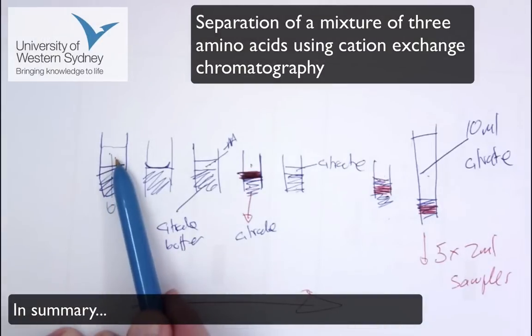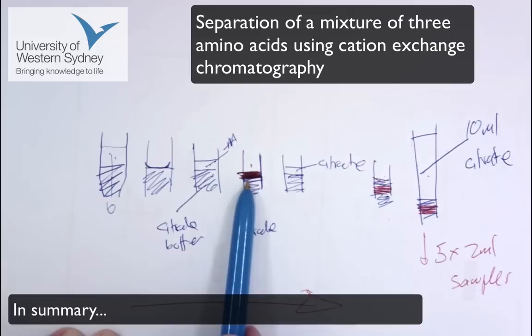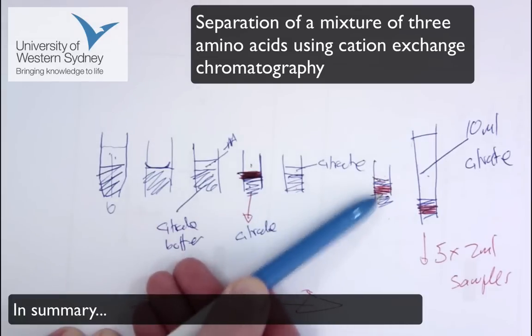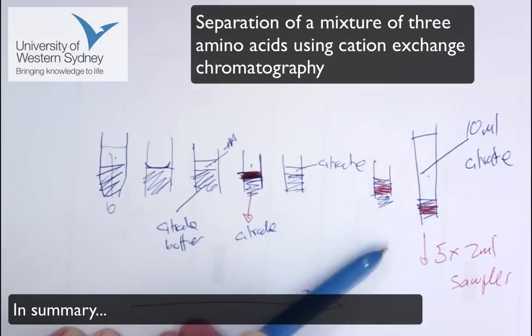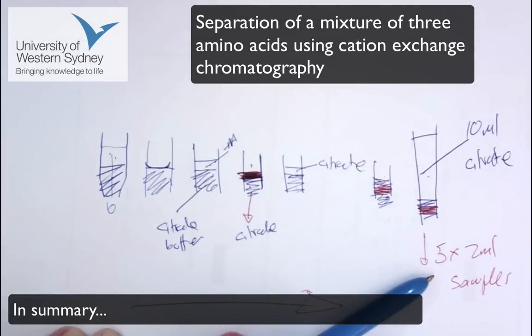Firstly, you're just running a bit of the old buffer out. You're then loading your amino acid in a small volume. You're then pushing that into the column, but it's only on the top of the column. So you add a bit more citrate buffer and just run that bit in, but you're actually really running the amino acid into the column, and you haven't added enough buffer to elute the amino acid. So the amino acid can only be in the column. You then stack it up with the 10 mils and collect your 2 mil samples. So if you get something wrong during this step here, it probably won't work. But if you get this bit right, then you should get really nice results.